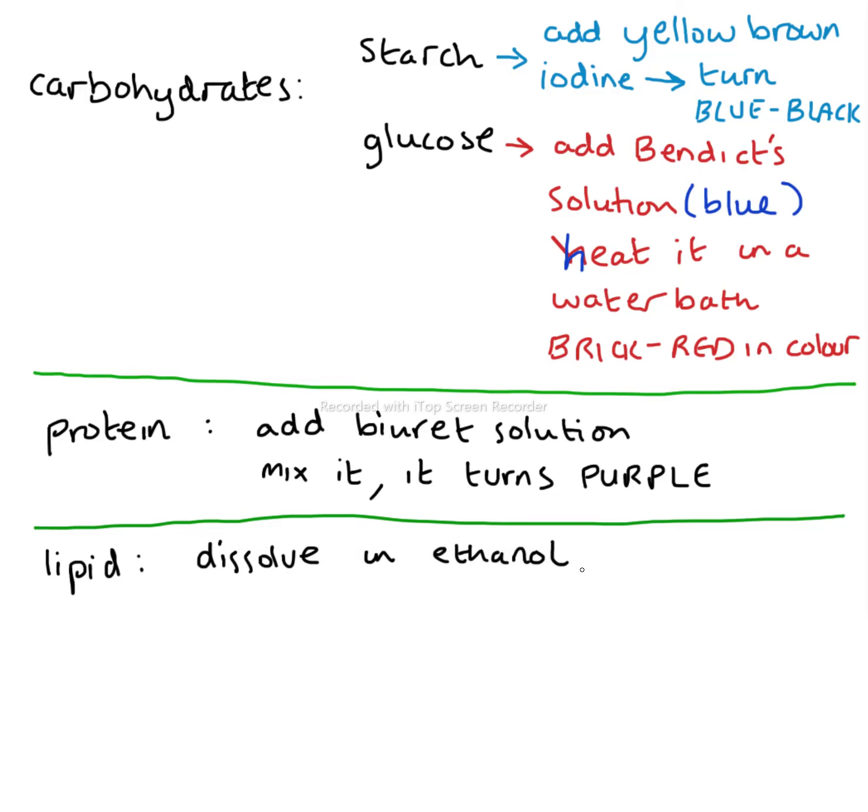You dissolve it in ethanol, then you shake it to make sure all the oil is dissolved, and then next you pour the solution into a test tube, or you can use a beaker, test tube of cold water.